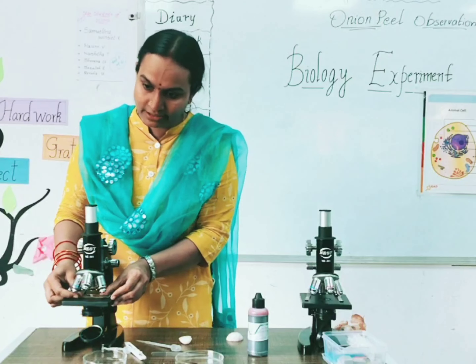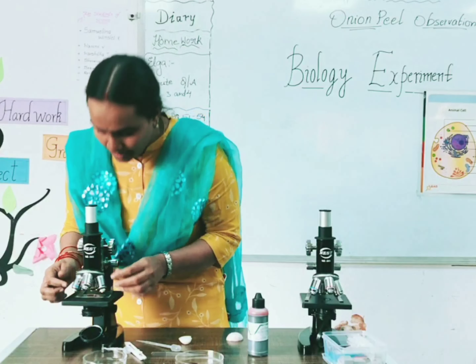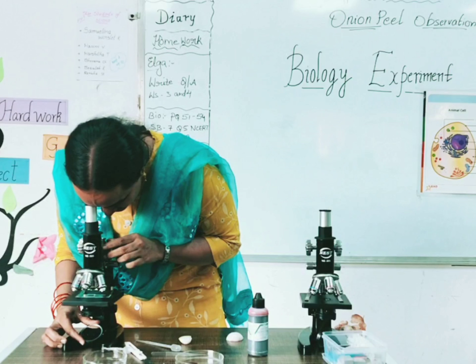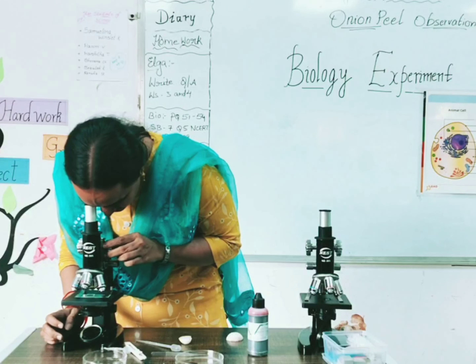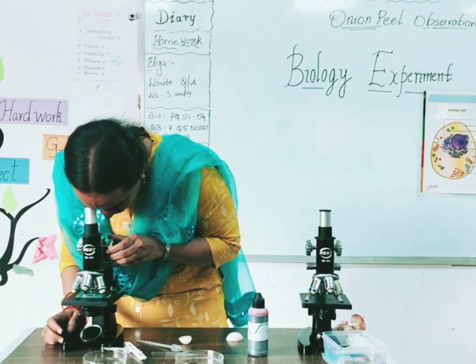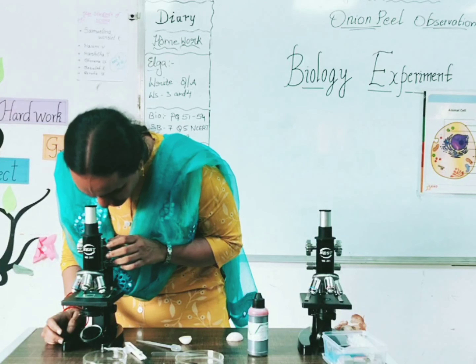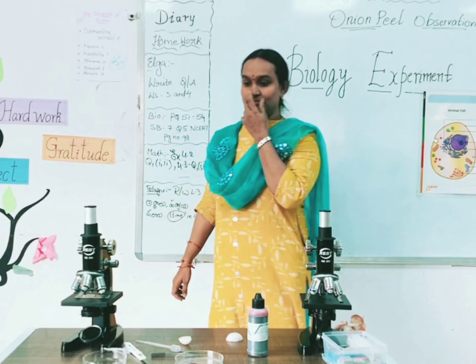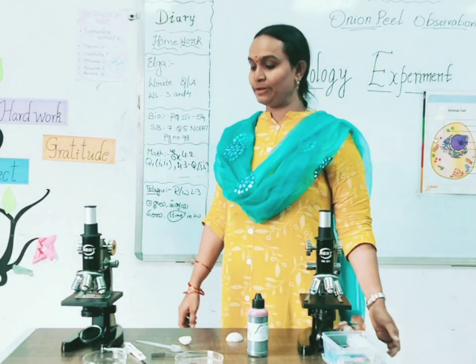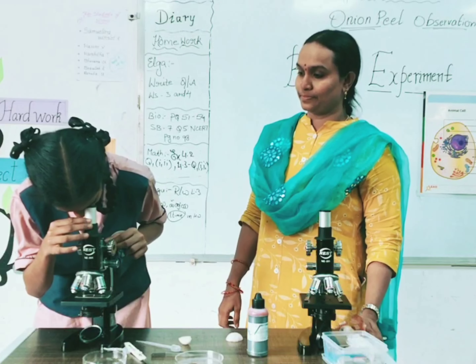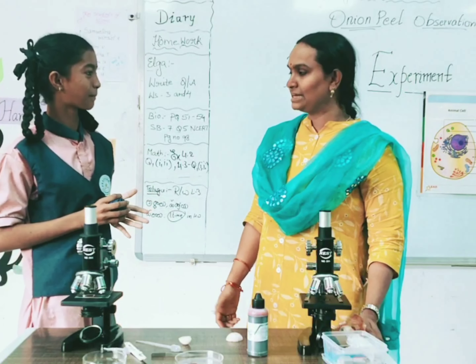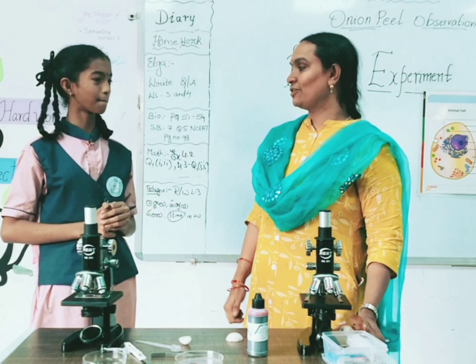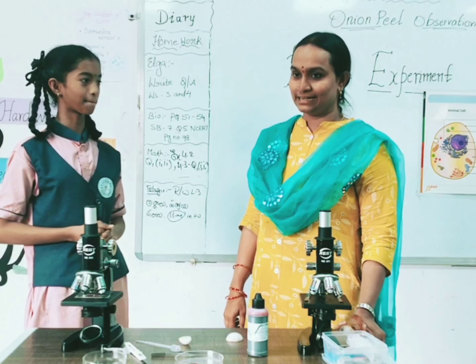This is how you need to do it, children. Adjust the lens. Now our slide is ready. Observe the slide and tell me what can you see. Some cells I have found. Which cells? Plant cells. Plant cells — yes!